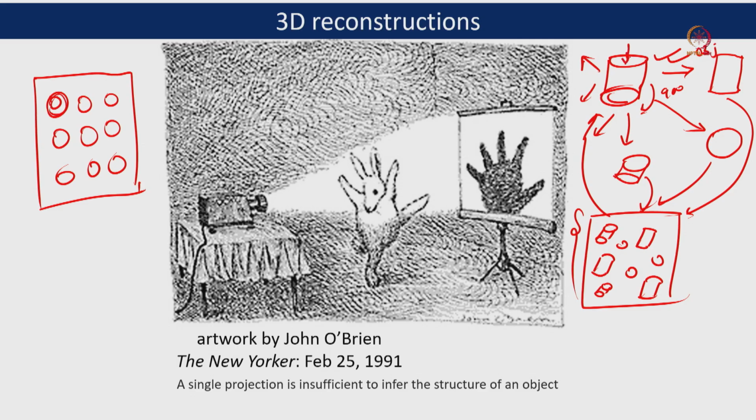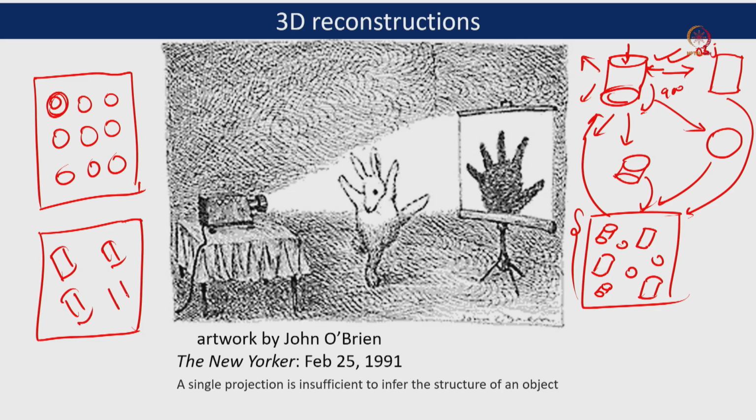If this is the top view and this is the side view, we are getting only the one view. In the other condition, if we are getting only this kind of view, this is also a very biased view because we don't have all the views here. So it is the side view it is showing.